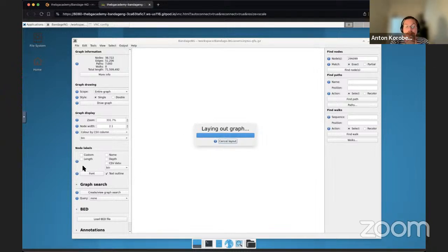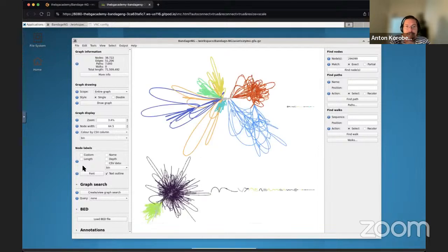So this is the node that is common to multiple species. Often if you analyze MAGs, it's good to find out what those common nodes are. Let's see if it is what we're expecting.